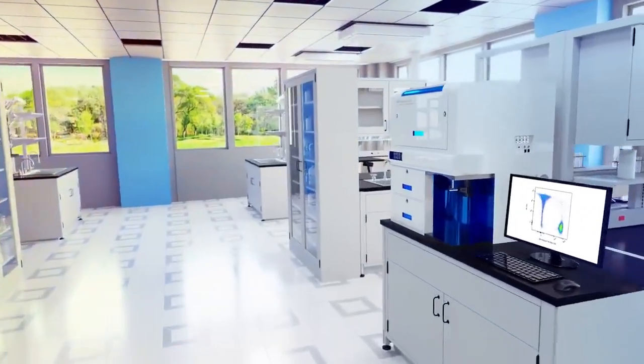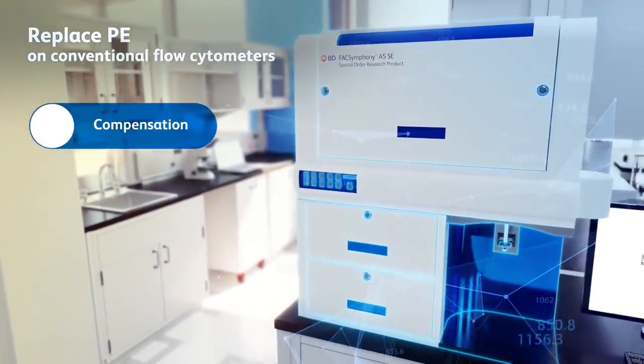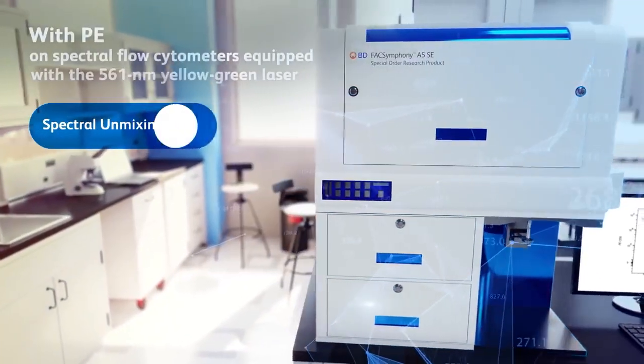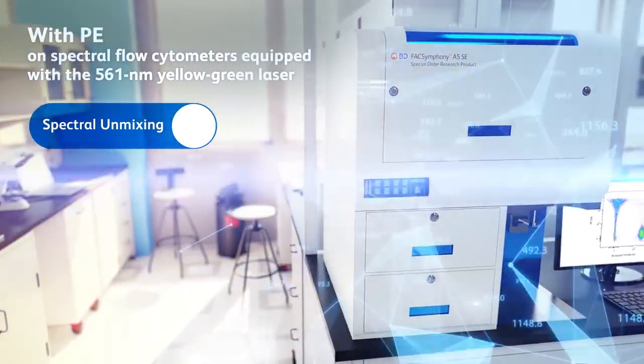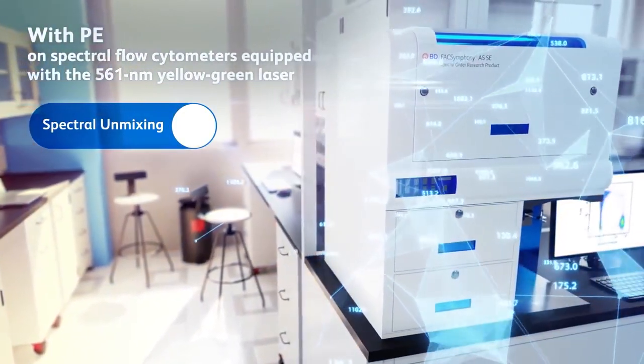RY 586 reagents can replace PE on conventional flow cytometers or be used with PE on spectral flow cytometers to increase parameters for deep scientific insights.